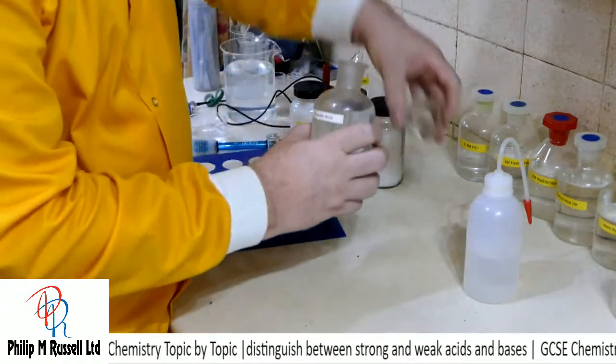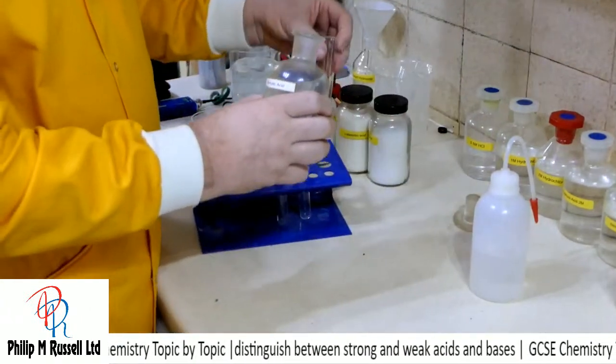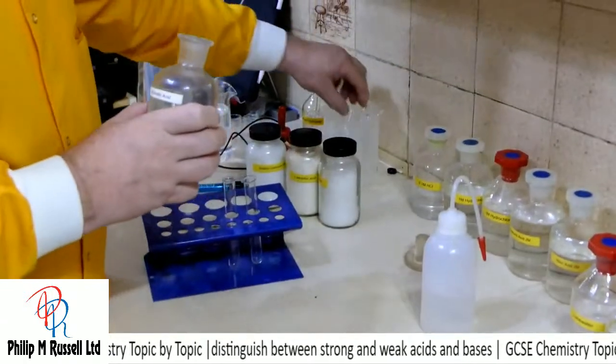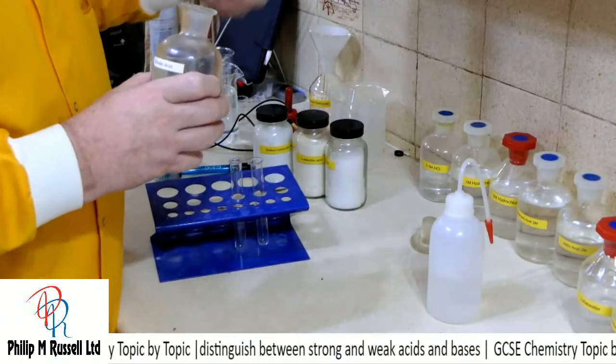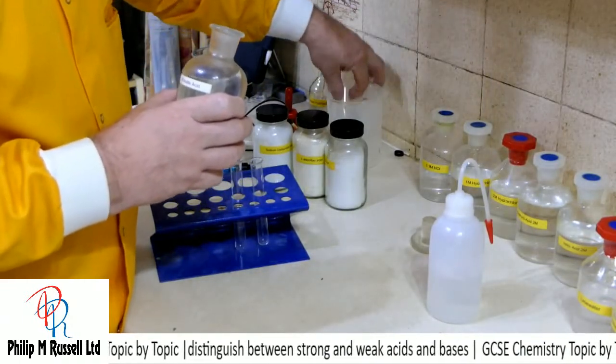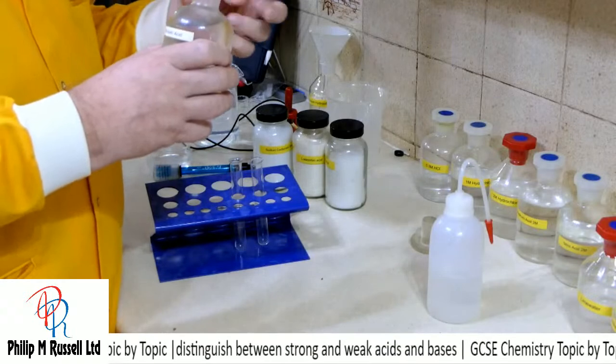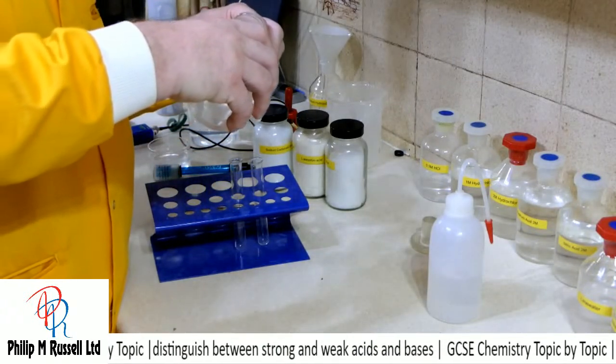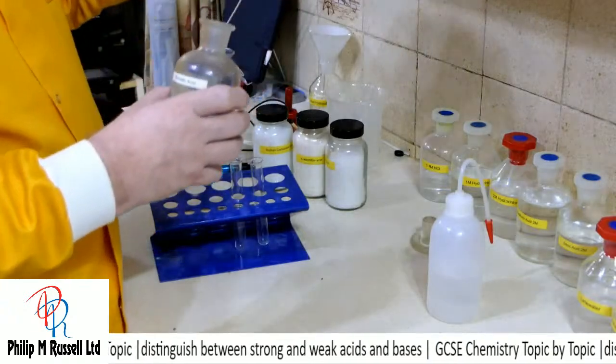There we are. The glass stoppers aren't used so much these days because they're relatively hard to open, so we switch over to plastic ones now. Let's just put in a small amount. There we are.